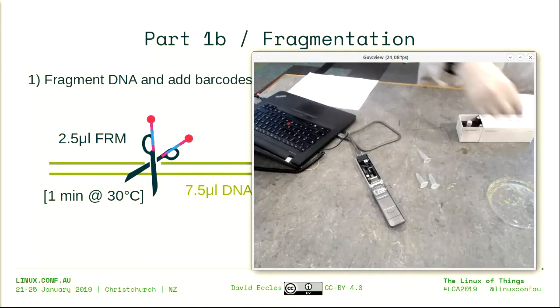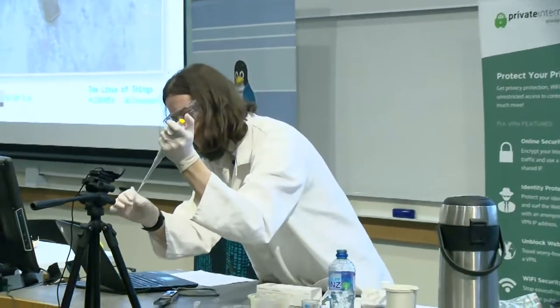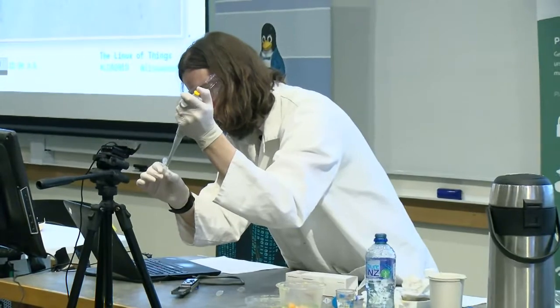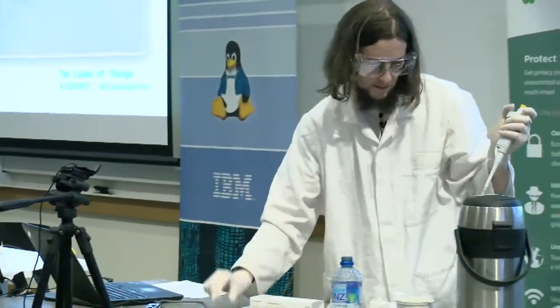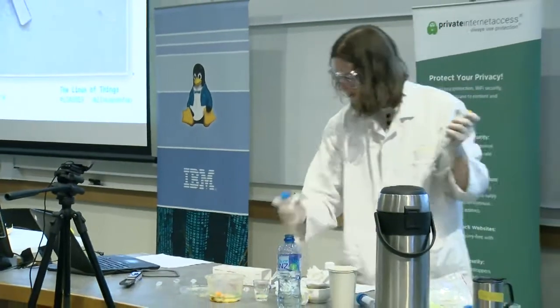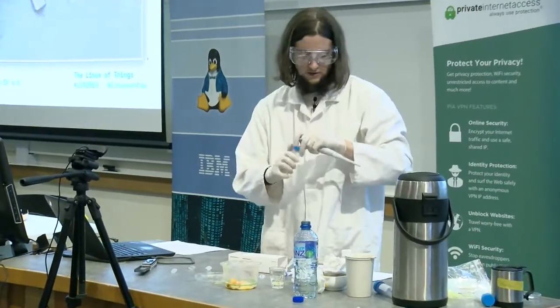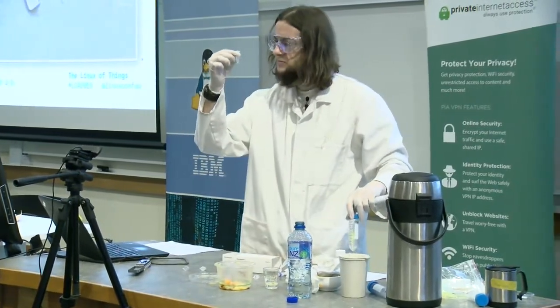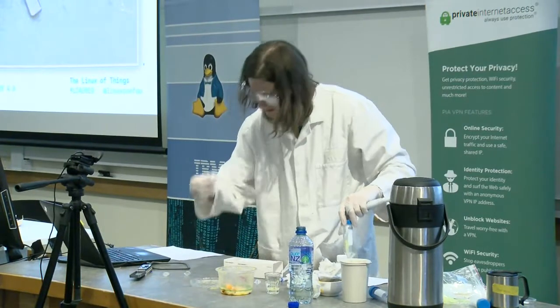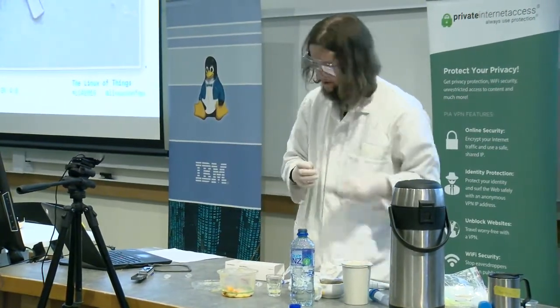Well, there's something in that tip. Now, I don't want to contaminate these, so that tip's going to go. Oh, I've forgotten which tube I used. Oh no, there it is. I better label this.